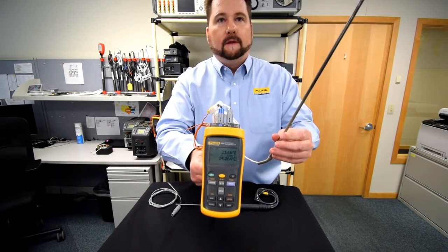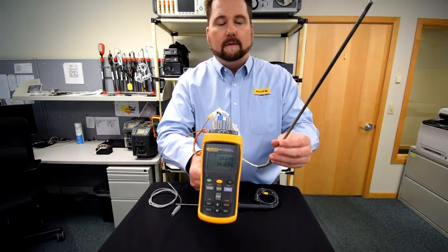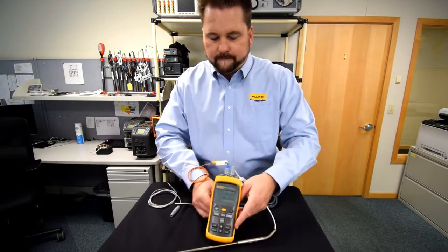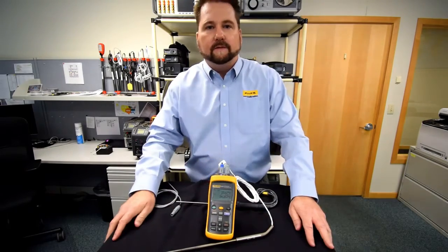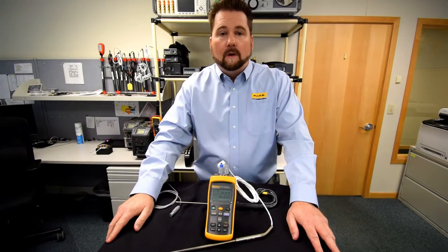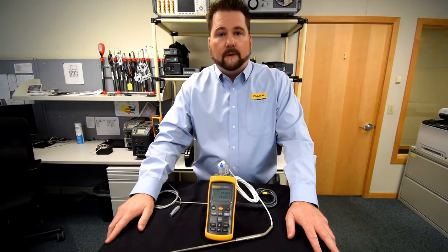Now you've got your dual channel setup and you're ready to log and take your data. That's just a quick rundown of this unit. If you have any other questions, please email me or our team at sales@flutecal.com, or visit us on the web at www.flutecal.com. Thanks!